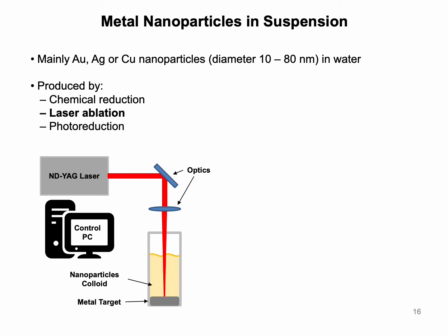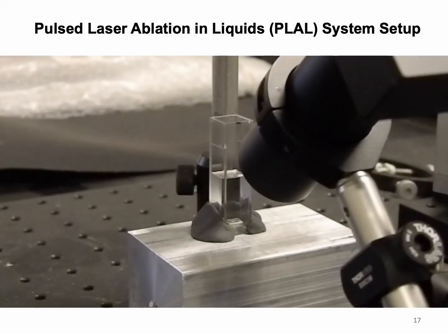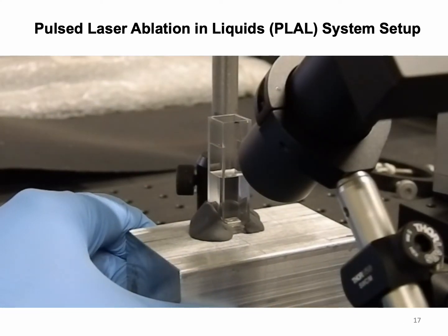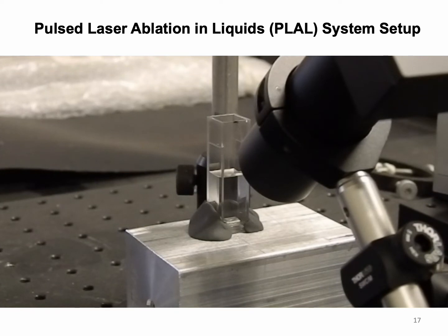A metal target, be it silver, gold, or copper, is immersed in an aqueous solution of a suitable stabilizing agent inside a cuvette, and the laser beam is focused on the target surface. In this video, we can see how the system works. The method is called Pulsed Laser Ablation in liquid. It is relatively quick, and with a few milligrams of silver, we can produce several milliliters of nanoparticle solution.